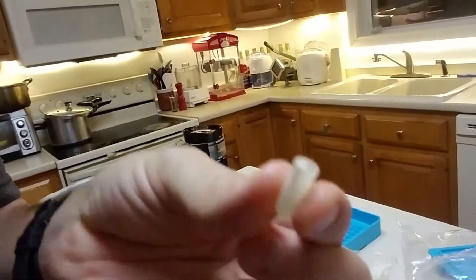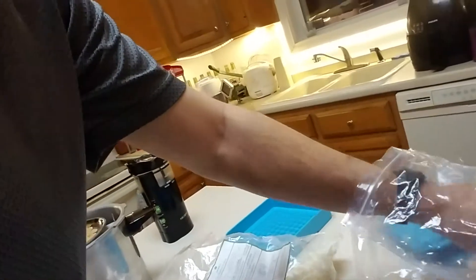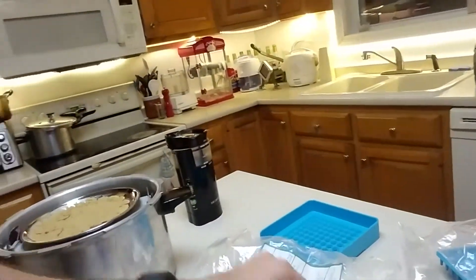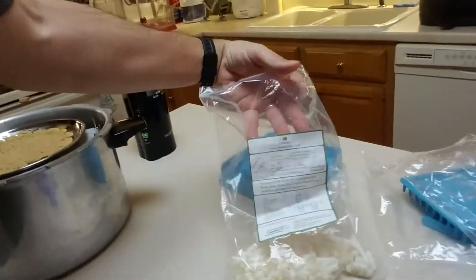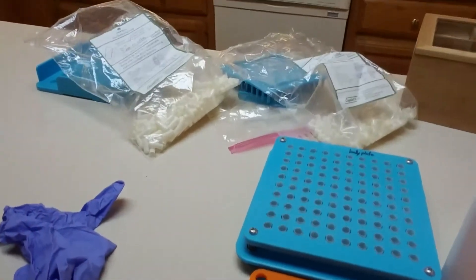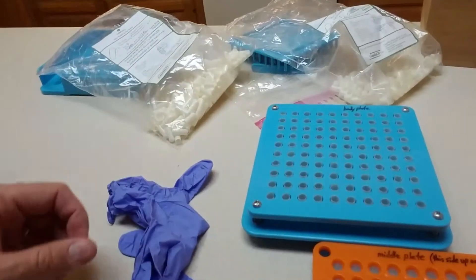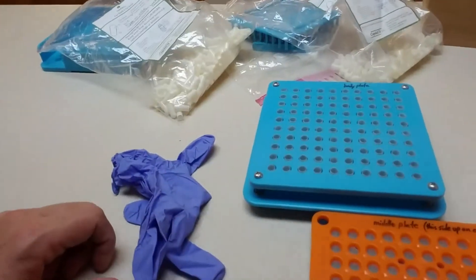Here's one capsule, and then I've got the tops. I bought these from Capsule CN, direct from China — you can get 2,000 capsules for about $40 US including shipping. These are size zero capsules. I also have this capsule filling machine, which is pretty handy — it was about $20, also directly from China. With that, I can fill 100 capsules at a time.